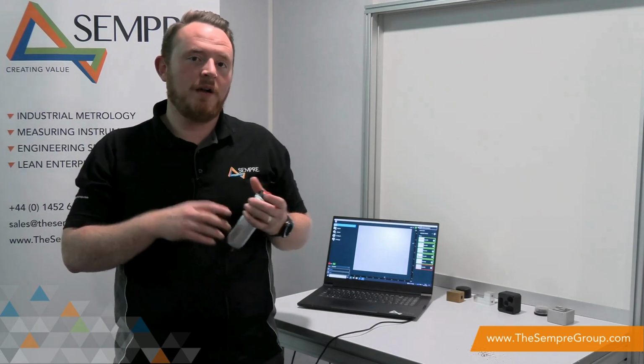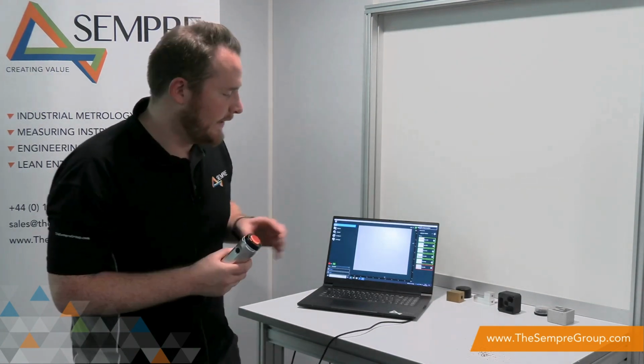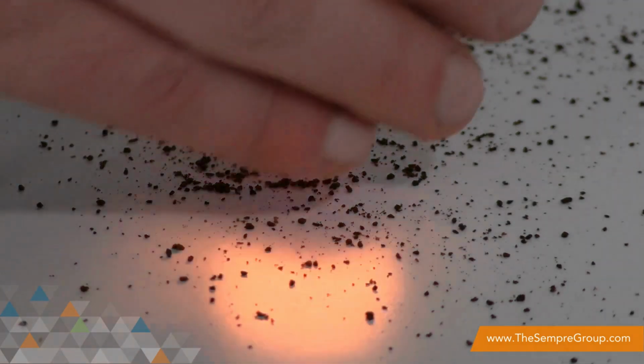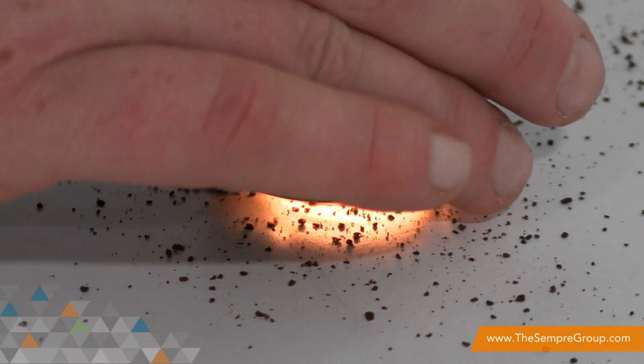Using the GelSight system, we're able to quantify the size and number of particles within a field of view. What we've got down on the left hand side is some coffee grounds as an example for what we could use as particles, or to explain the particle function. So I'm going to take the GelSight system, place it over a section of the particles, and click capture.